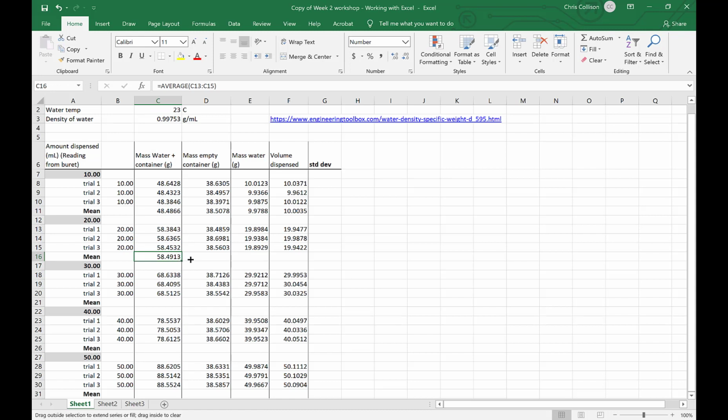And then I can drag across. Another thing I can do, if my argument range is the same, is Control C to copy that value, and paste it with Control V down into this cell here. And again, I'm going to use the fill right. There's a dragging approach in here. I'm going to try a different approach. Control C, Control V. So I've now pasted my value in here. It's the mean. Another thing I can do, press Shift, click.